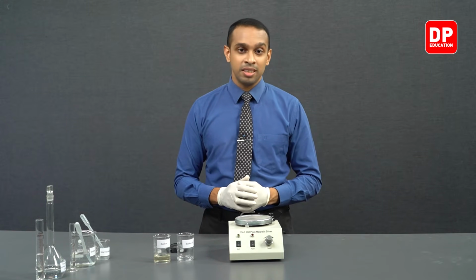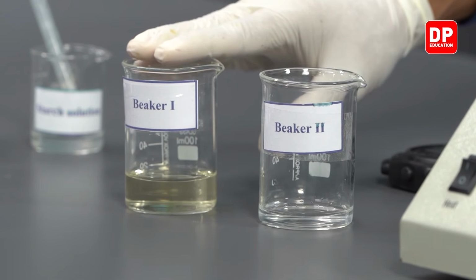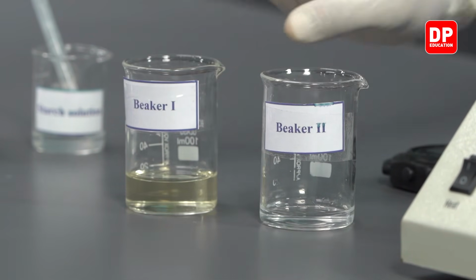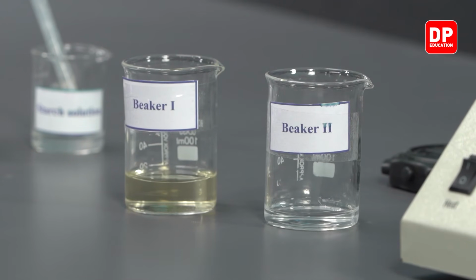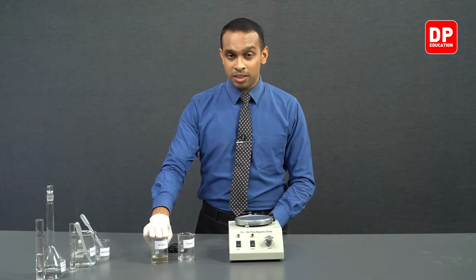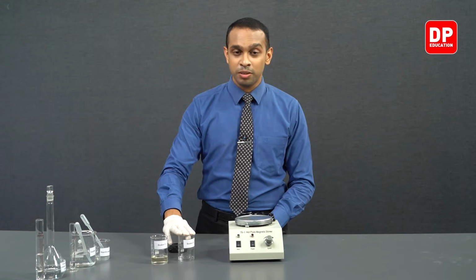So the very first reaction we'll be carrying out is by mixing 25 cubic centimeters of Fe3 plus aqueous ion solution in this beaker 1 with 8 cubic centimeters of iodide ion solution in this beaker 2. So in these 4 reactions we will be doing today under part 2 of this experiment, we will not be changing the volume of Fe3 plus ions. However, we will be changing the volume of I minus ions solution we will be using for this part.